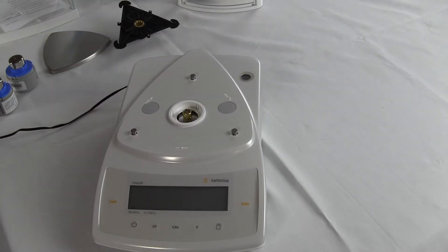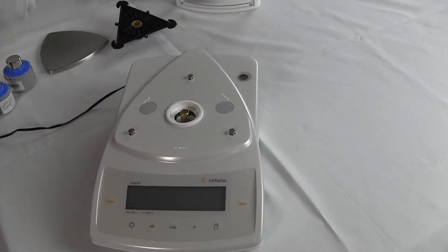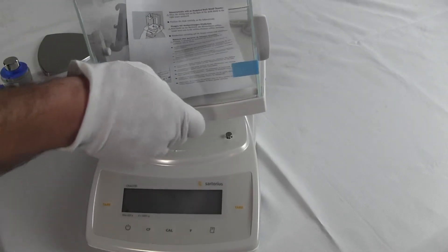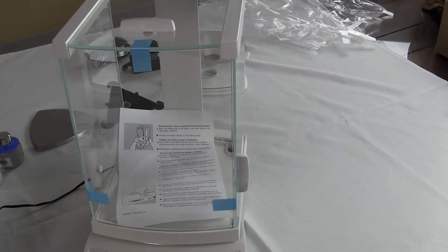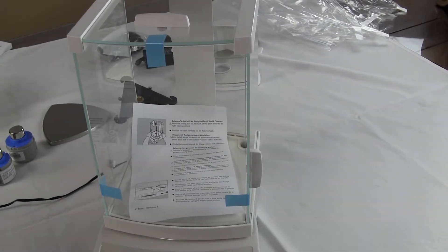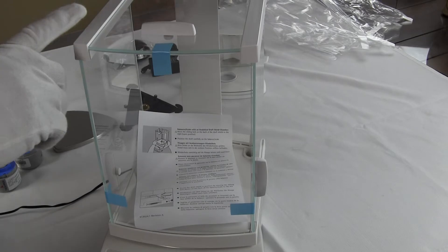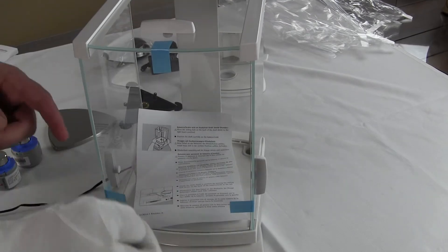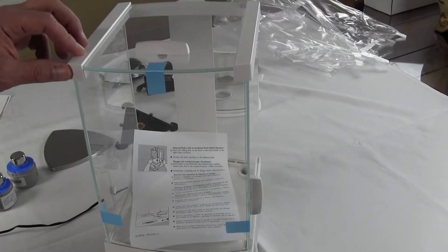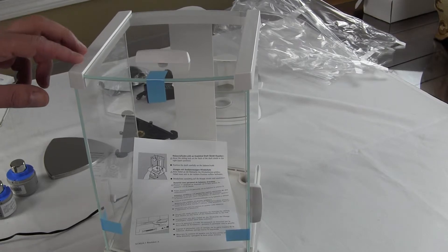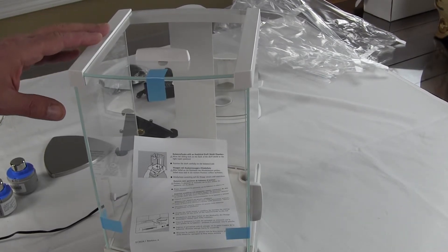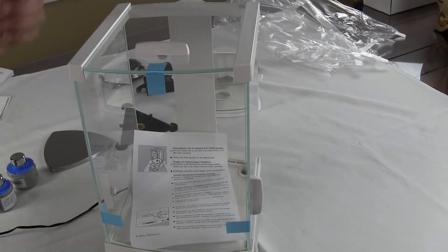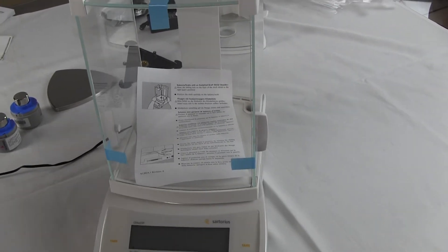Now I want to show you, you can also purchase from Sartorius, this is their optional taller glass draft shield. It goes right on this balance. Now, this part number is the YDS-01CP. This is an optional three-door glass draft shield. One would buy this, especially if you were doing specific gravity. If you bought the specific gravity kit, you really need to buy the full draft shield with a much taller height.